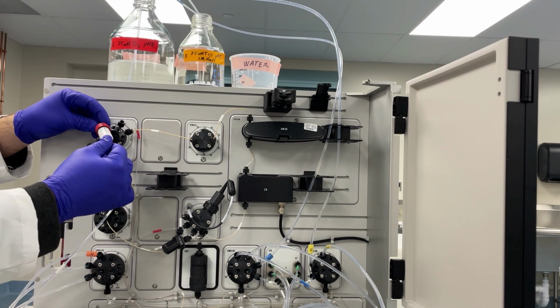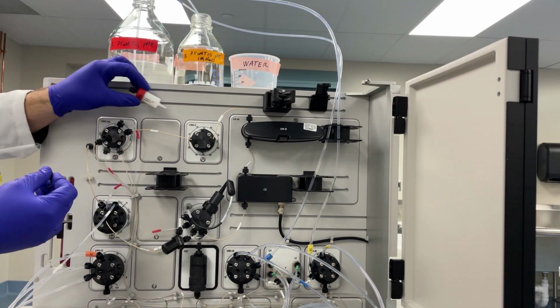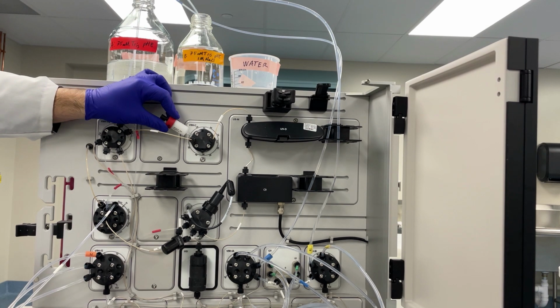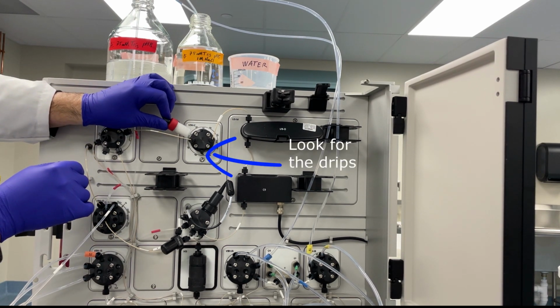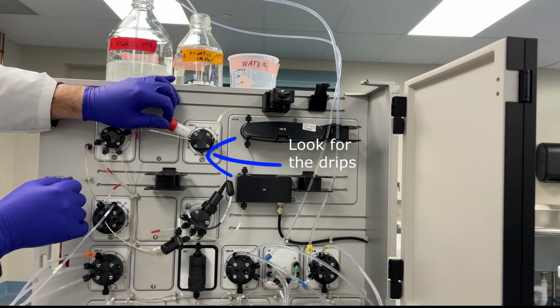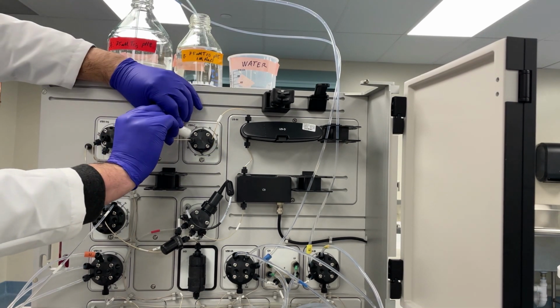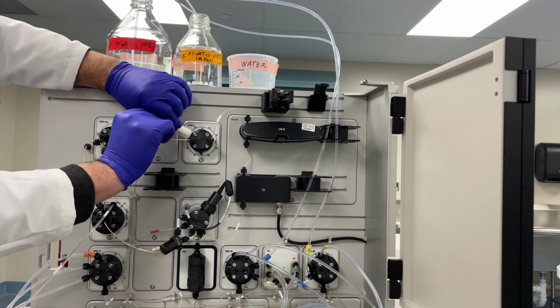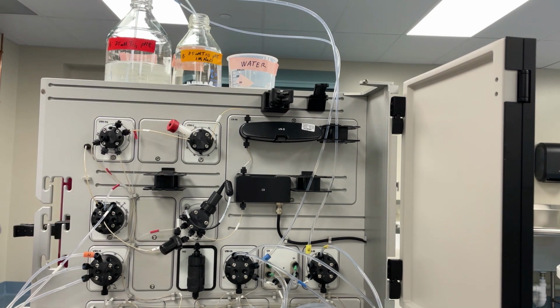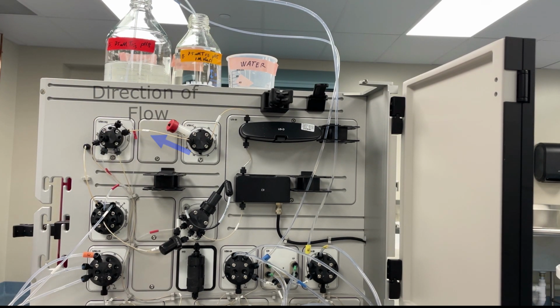We're going to screw the bottom of the column into the top of the column valve. This means the column is going to be in upside down, but that's fine. The column will work either way that you position it. We'll start screwing the bottom of the column as we unscrew the top of the column. This will prevent any air from getting into the column because there's constant flow.